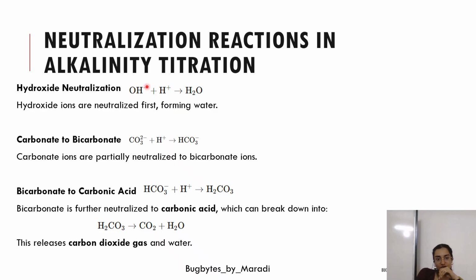When you add acidic content to the water which contains hydroxide, it neutralizes to form water. Here you have to remember that 1 mole of hydroxide ion reacts with 1 mole of acid to give water. Neutralization is done.